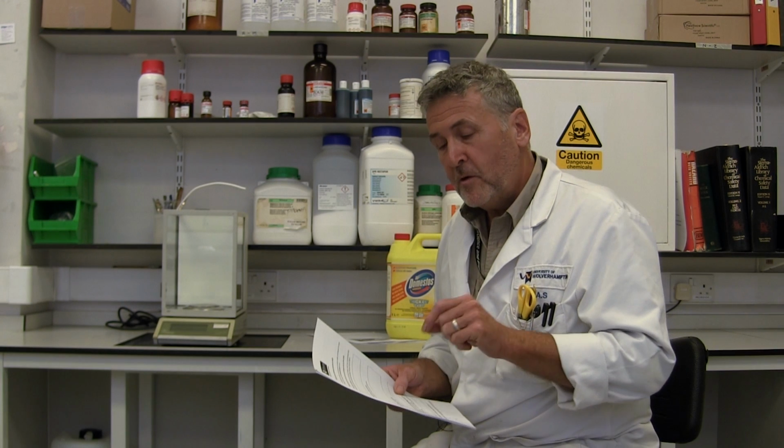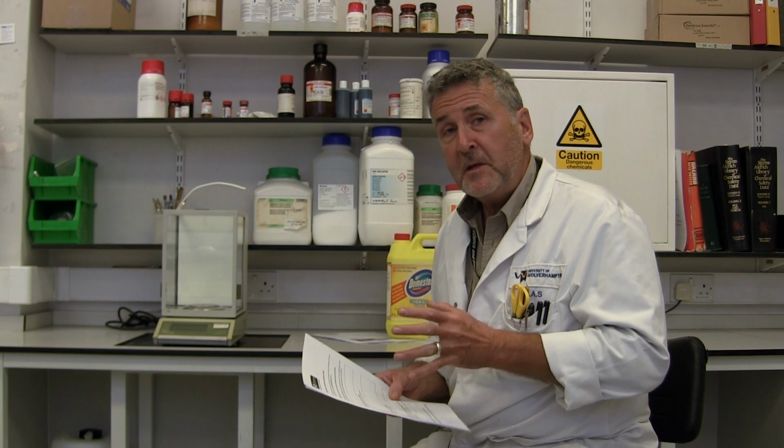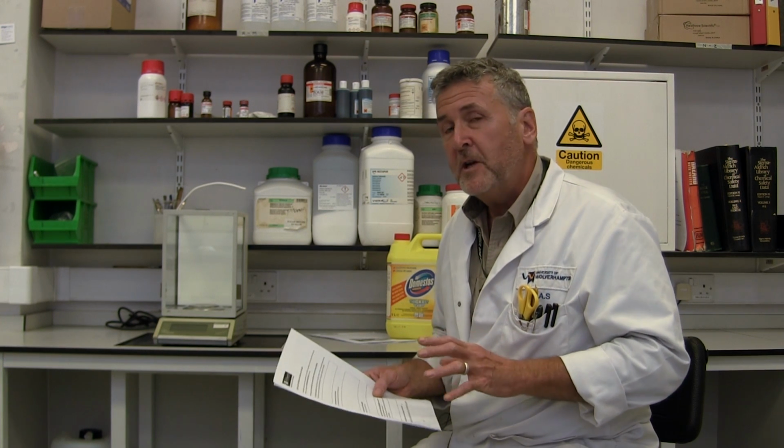We work on the basis that if you actually have to sift through the information yourself and then write it down in your own hand, you will then actually maybe remember some of it. So if it says, never add this substance to water, that might actually stick in your head. So when you come to use the chemical, you'll go, oh, I must remember that. Whereas if you cut and pasted it, you may not have even noticed you cut and pasted those words. So it's a safety thing. We found it works very well. Yes, I know it means you've got to fill out each form by hand, but it won't take very long, and it can actually save you from some harm.